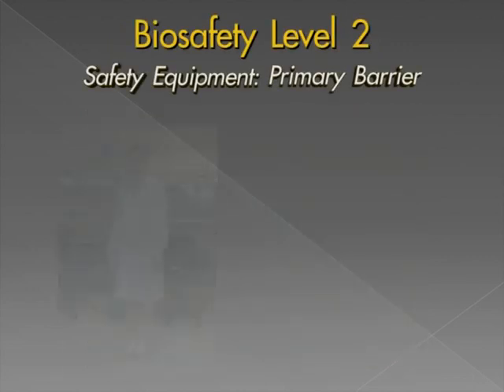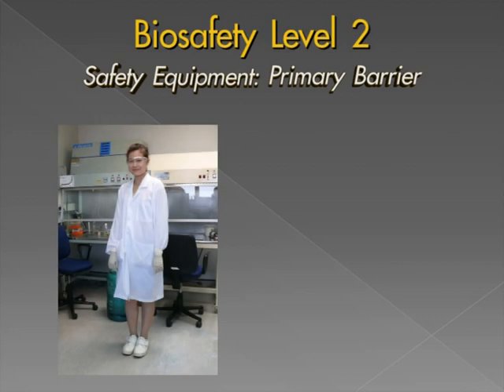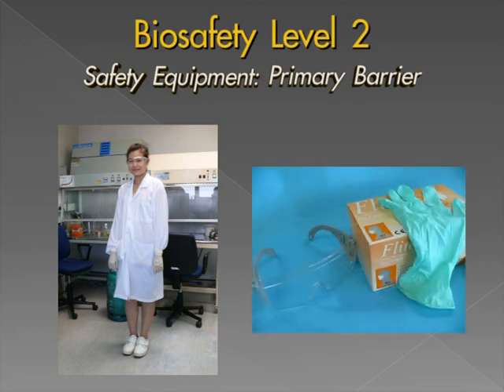Safety equipment, personal protective equipment. Personal protective equipment for BSL-2 is the same as that for BSL-1. Gloves and lab coats must be worn, and eye protection should be used when splashes or aerosols are anticipated.